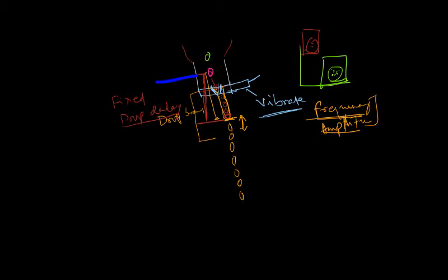Once we can control this break off point, we know the drop delay. There are processes to find out the drop delay that I will talk about in a separate chapter altogether. Here I'm just saying, for example, this drop break off point is fixed and we know the drop delay. Then we use electrodes and charging to charge the stream. So first we make a detection, then it will be deflection.